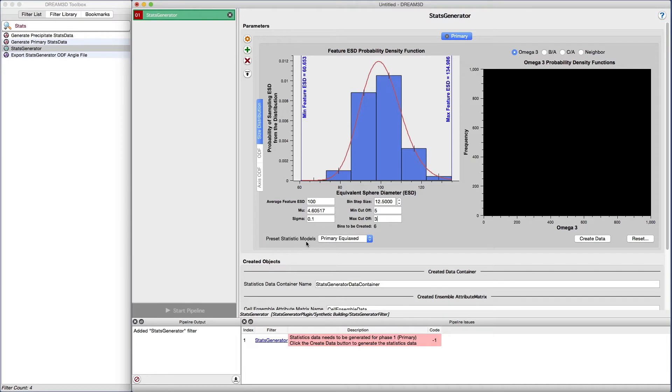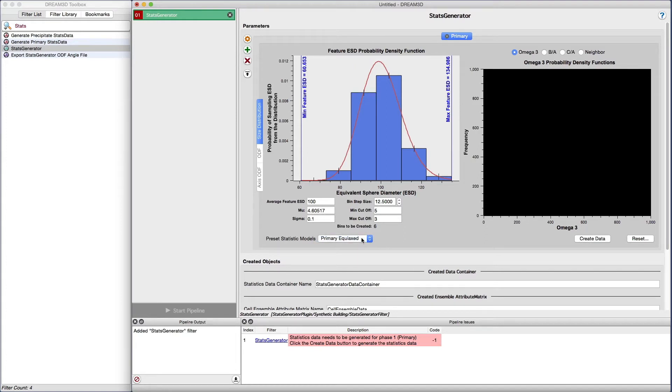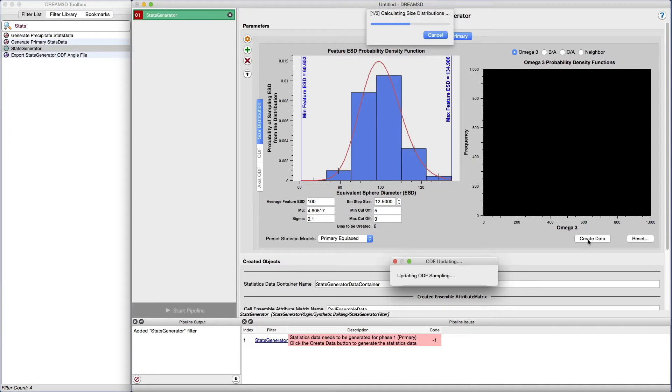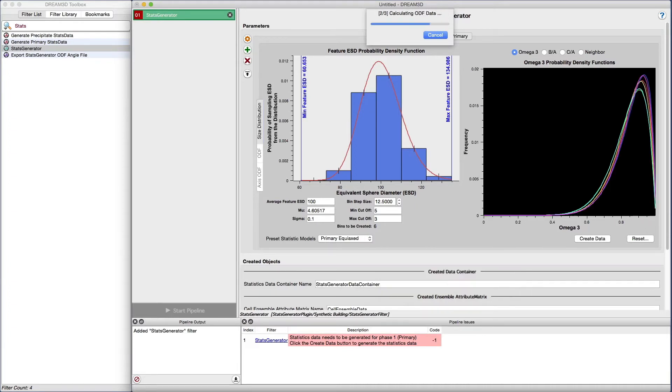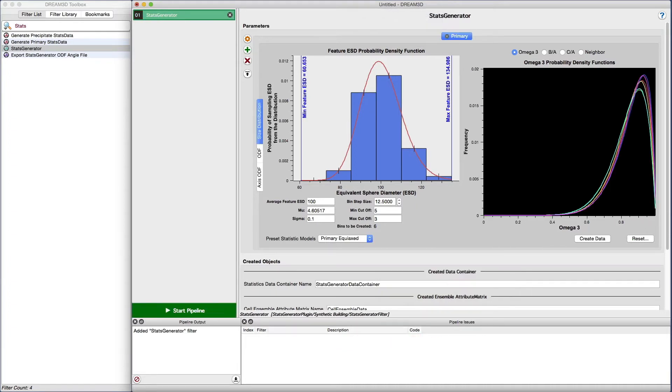There are several morphological presets that the user can select. For now, we're going to stick with the primary equiaxed preset. Once we have our initial target values set, we can click the create data button to allow stats generator to generate the initial distributions that are used during the synthetic generation process.